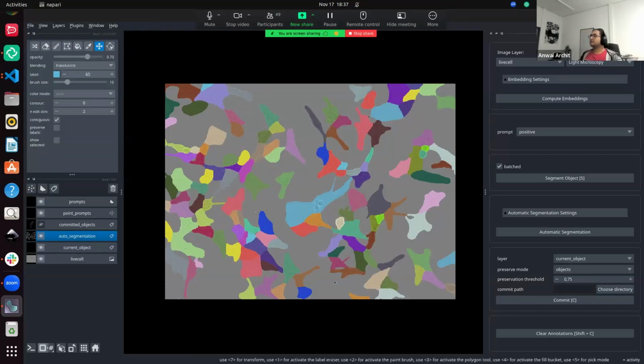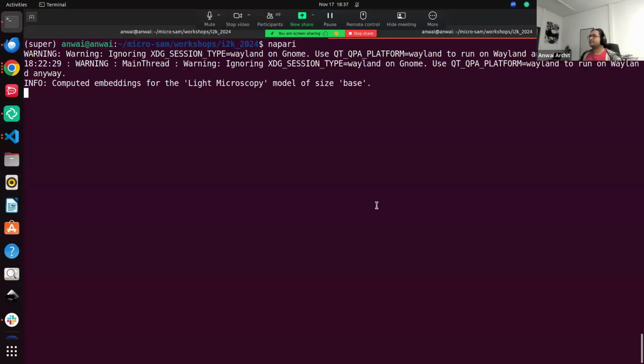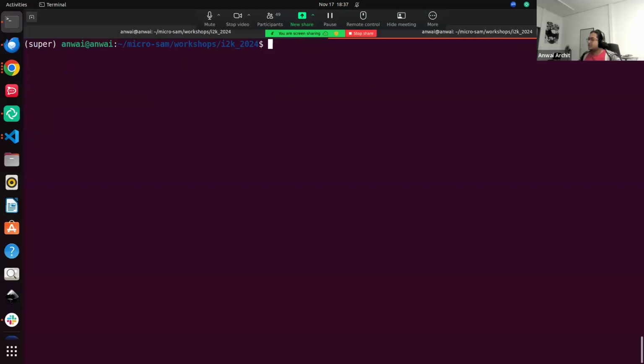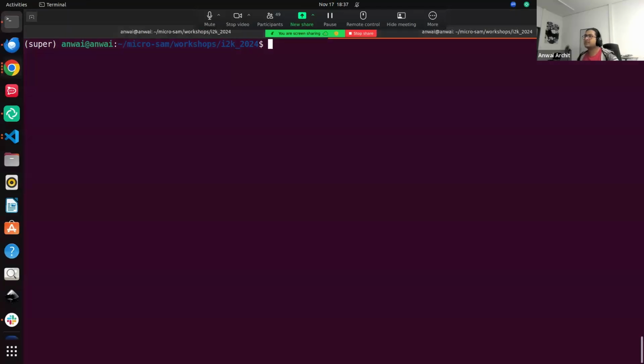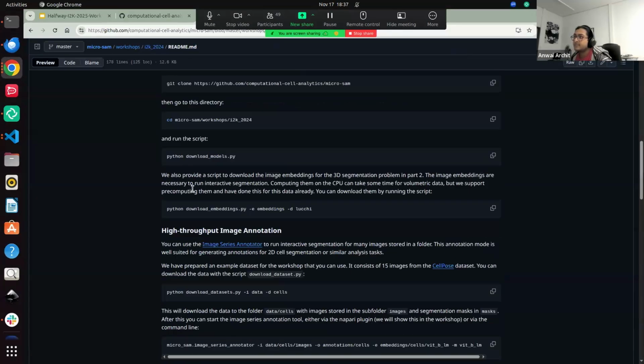Okay, let's close this because our task is done over here. Okay, this is task number 1. Now, what's task number 2? Let me quickly search it up. I might have it here. Yes. Okay.